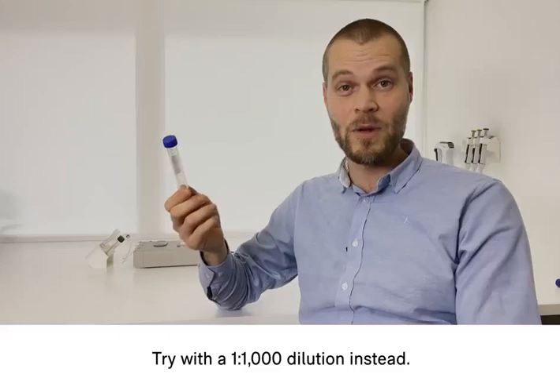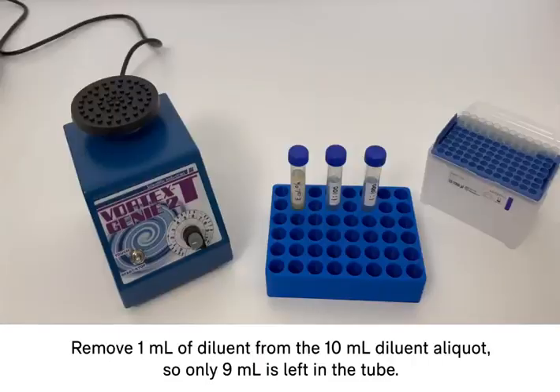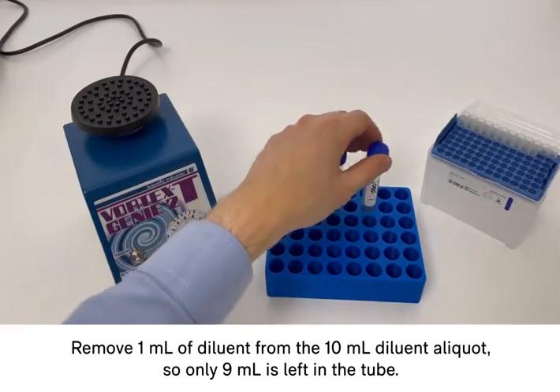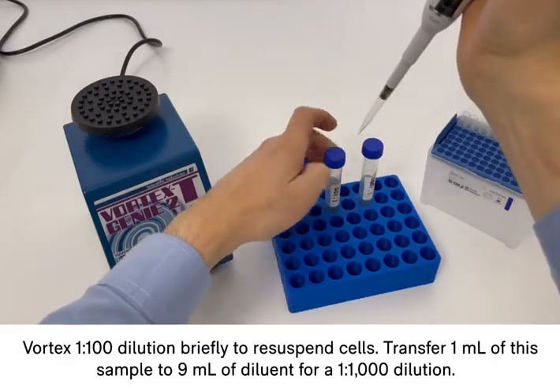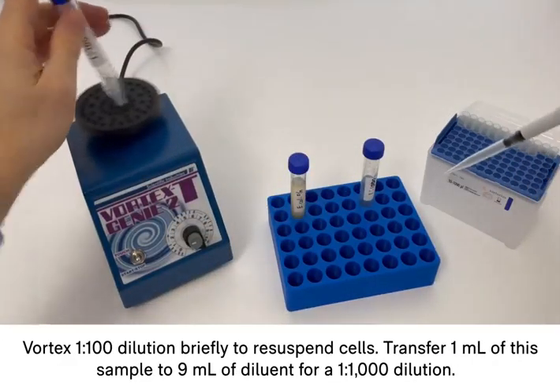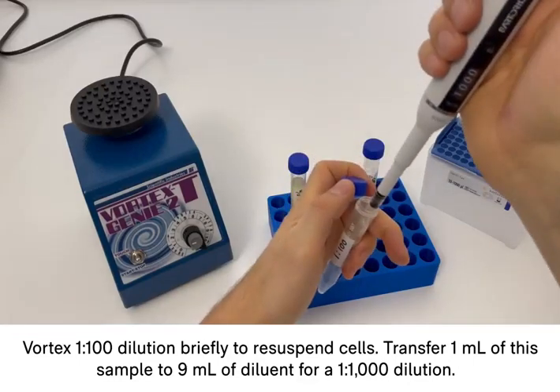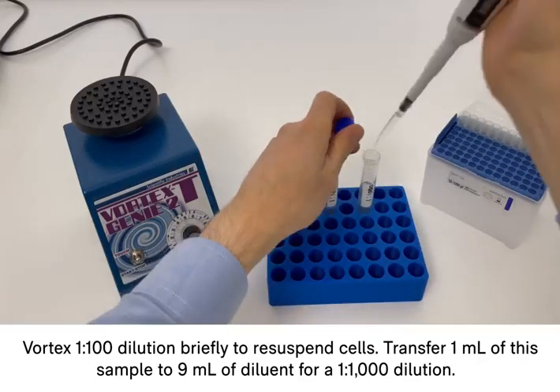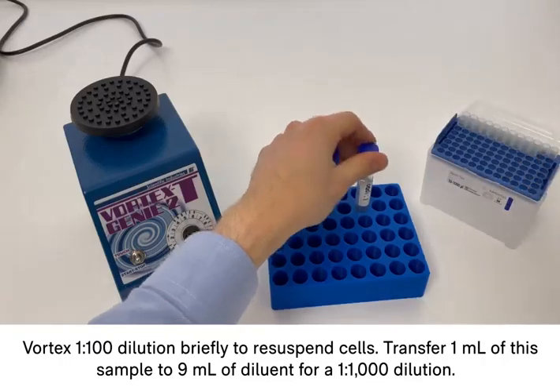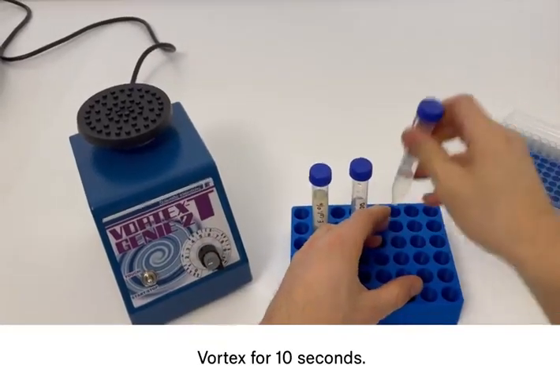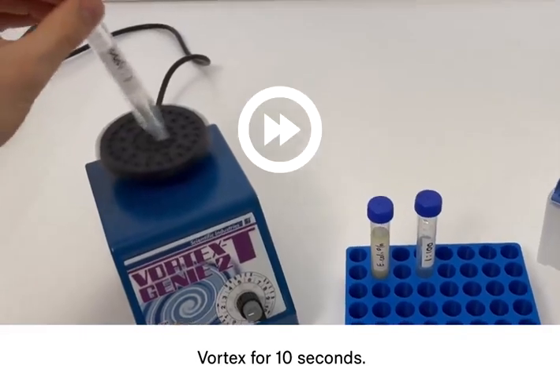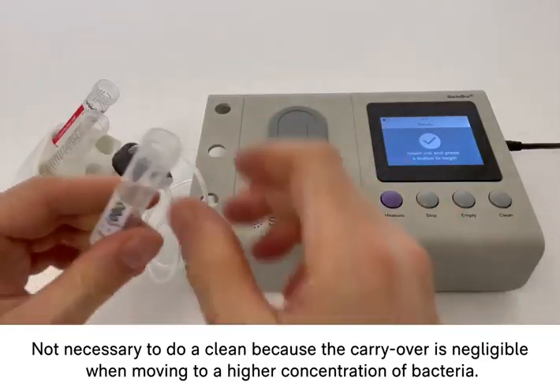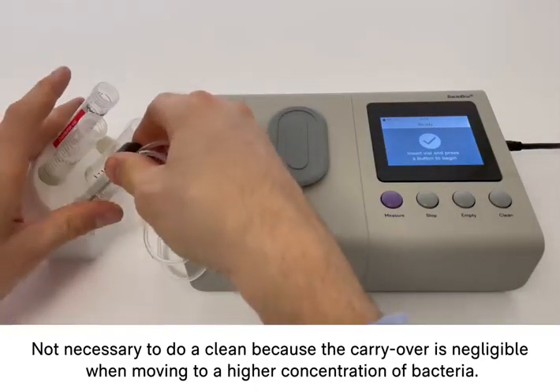Let's see what happens if we prepare a 1 to 1,000 dilution instead. To do a 1 to 1,000 dilution, I first remove 1 mL of the diluent so I only have 9 mL in the tube. Then I vortex the 1 to 100 tube briefly to resuspend cells and then I transfer 1 mL of this sample to the 9 mL of diluent. That gives me the 1 to 1,000 dilution. Finally, I vortex this sample for 10 seconds.